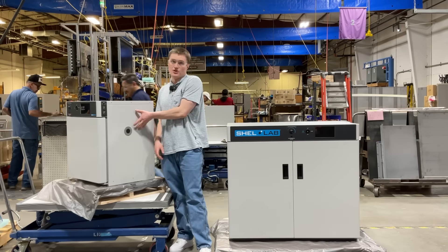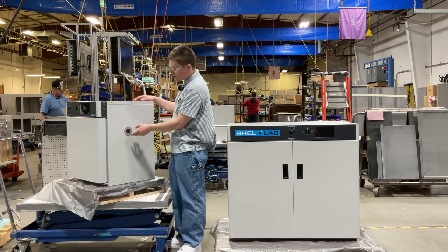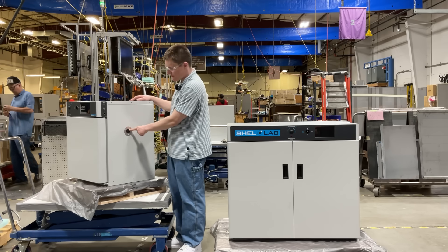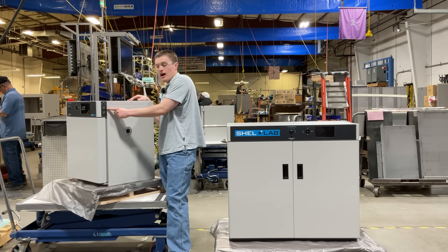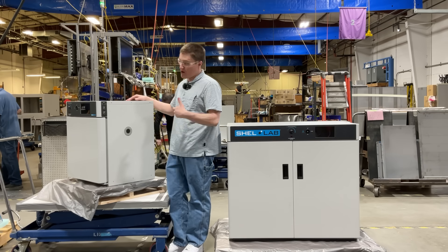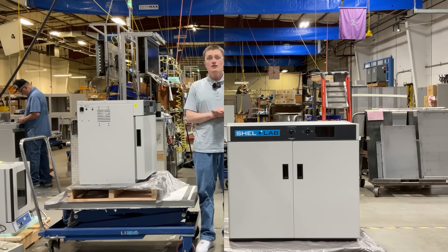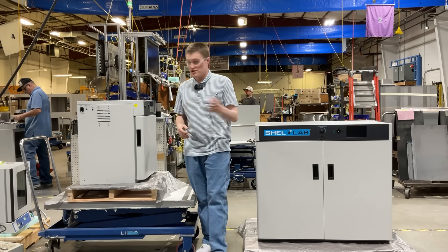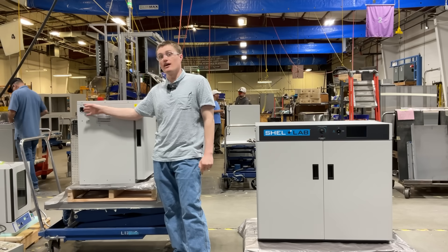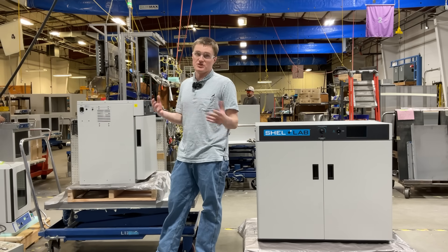Let's take a look at the left side of the unit. This will be identical on the SMI-2 and the SMI-11. First, you will notice the exterior of the expansion port that we mentioned earlier. In the upper left corner, you will find a USB port. This allows for digital data logging and monitoring, as well as analog ports for temperature and alarm monitoring. Located on the other side of each of the units, you will see the main power inlet. This features an externally located fuse drawer to allow you to replace the fuse at any time.